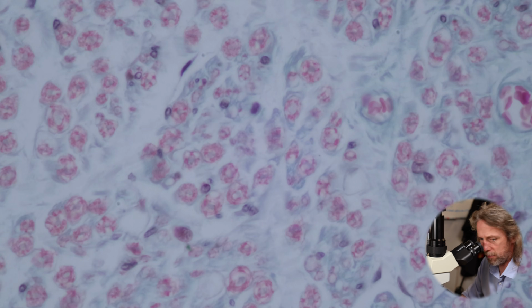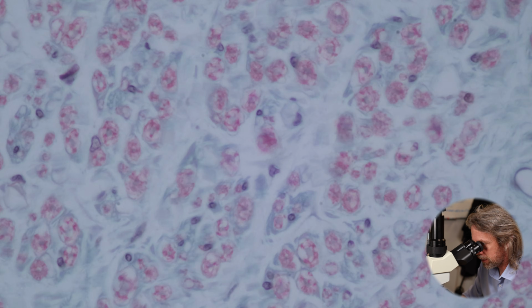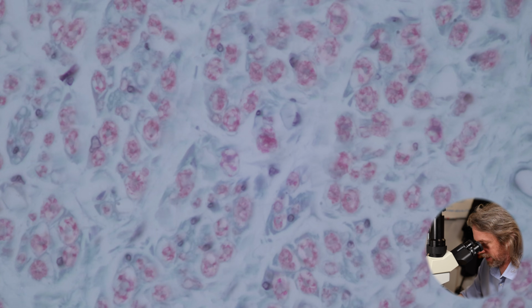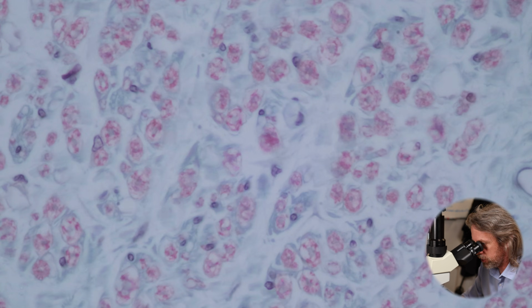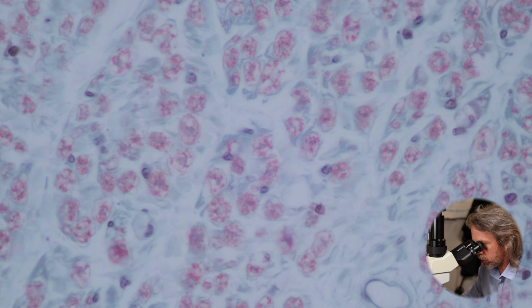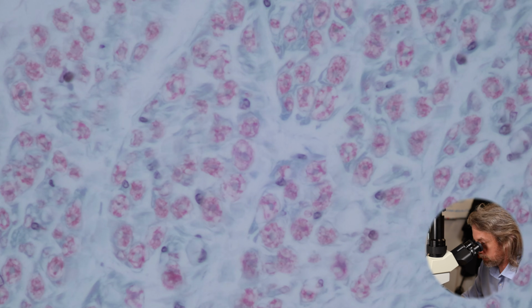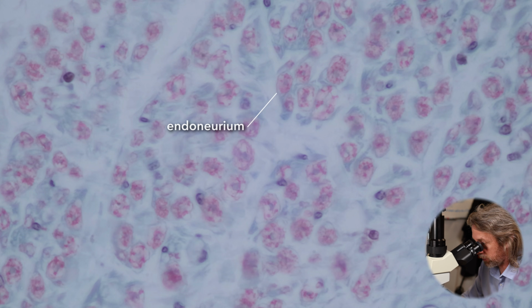Now, you can maybe see that, so we've got the green again, right? You've got your central thread of neuron, very difficult to make out, surrounded by your Schwann cell, and then there's a green circle around that. So I think this is a Masson's trichrome stain. The green is connective tissue, it's collagen. So around the Schwann cell, you've got a thin layer of connective tissue.